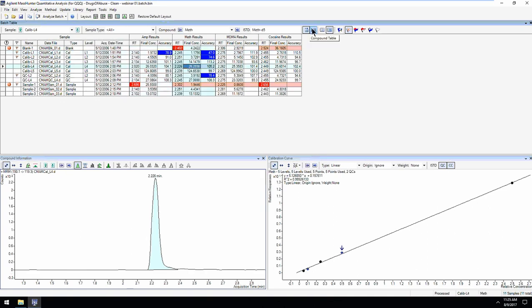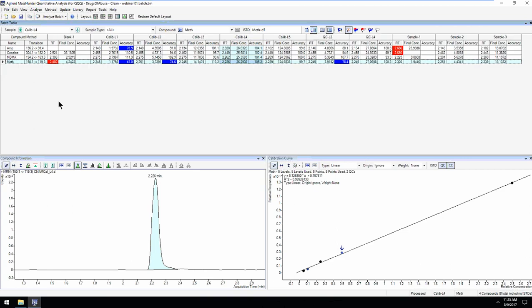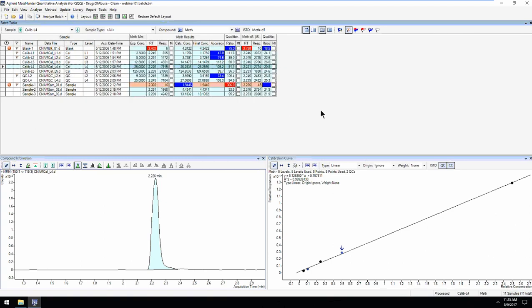parts of things. The last view, if you want, again, mixing all these options around, we can go back to compounds in our rows and then a sample summary in our columns. So lots of different ways to look at things depending on your particular needs and preferences.